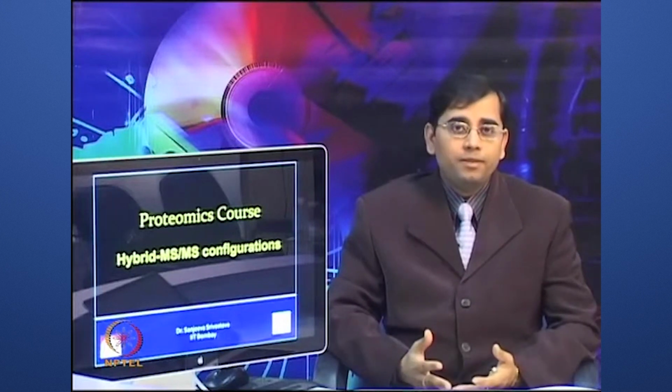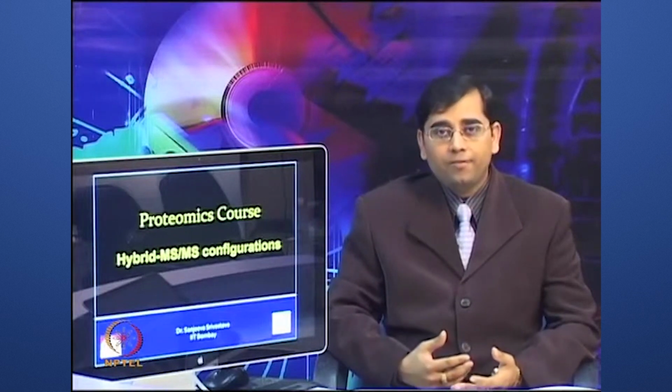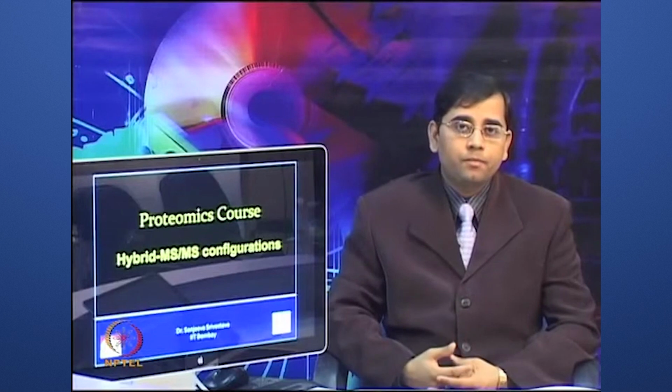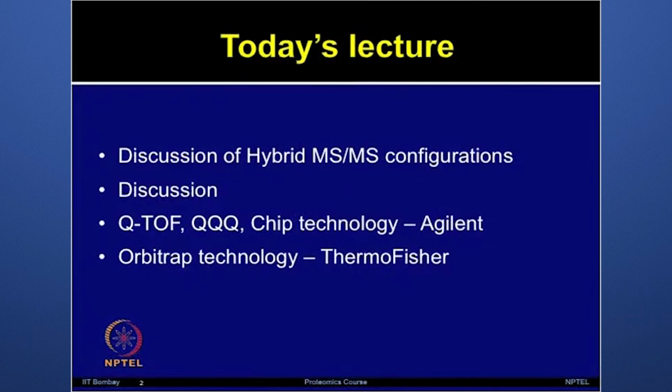There are several new advancements which have happened in this field, and to keep up the pace with these recent advancements, in today's lecture, I thought to involve a discussion on hybrid MS-MS configurations and talk with two leading companies, one with Agilent Technologies for QTOF and triple quadrupole, as well as the chip technology, and then with Thermo Fisher about the Orbitrap technology.